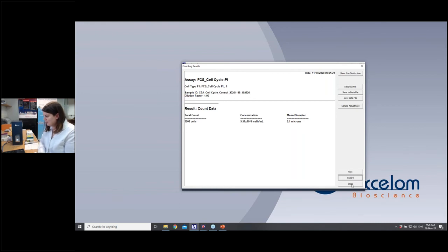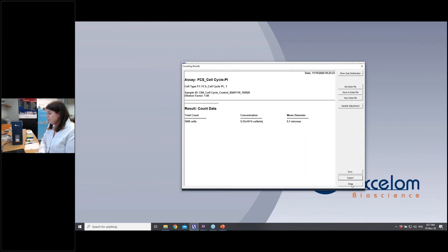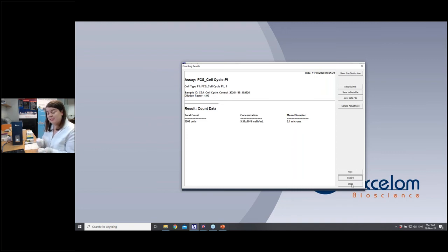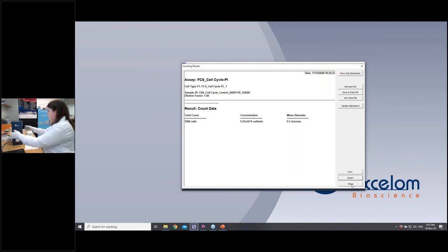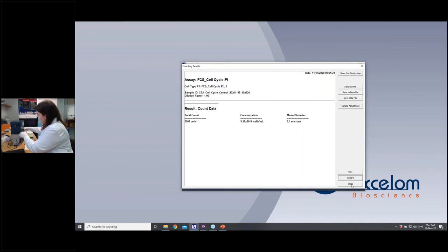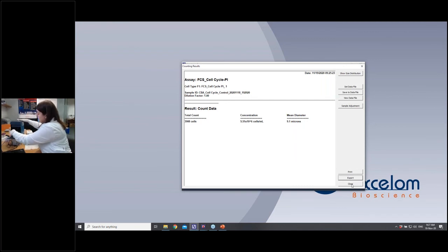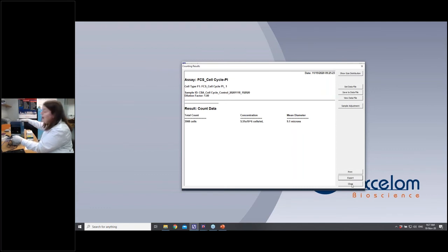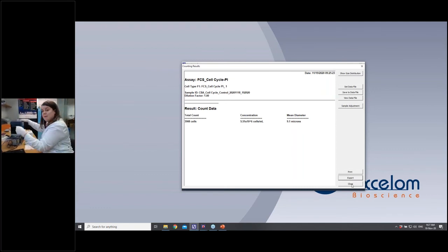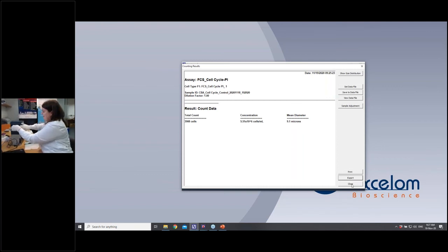Coming in so you said the Spectrum was really simple and easy to use and you said the Spectrum had multiple optic modules. How easy is it to switch between these optical modules? Yeah good question it's really easy so if you've got a multi-user lab but you're doing lots of different experiments you might sometimes want to have a blue module in you might sometimes want to have a far red you might want to have the PE one in for instance so actually I can probably show you so what I'm going to do is I'm just going to turn the Spectrum around the modules are in the back here and it's very simple you can undo the black here and they are very simply a clip in and clip out modules so you can change those very very easily and yeah all I would do is clip this one out and clip it back in again and then you're ready to go with your new module.